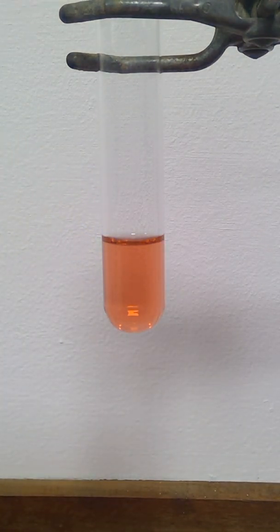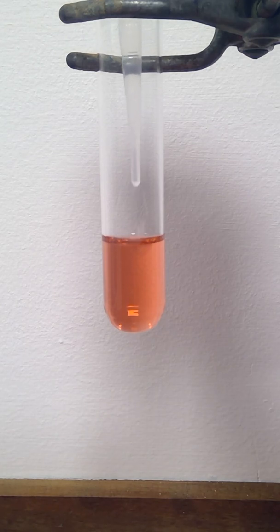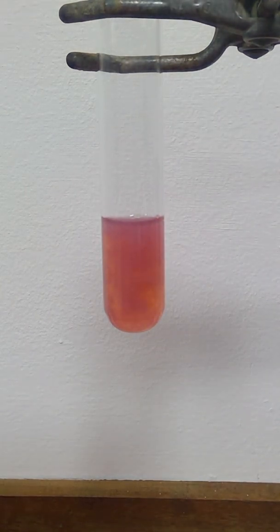Again, watch carefully as a few drops of the sodium carbonate are added to the pink cobalt chloride. So here a rather nice purple coloured solid has been made. This time it is cobalt 2 carbonate that has been made from the cobalt ions in the cobalt chloride and the carbonate ions from the sodium carbonate. So once again, spectator ions would be left.